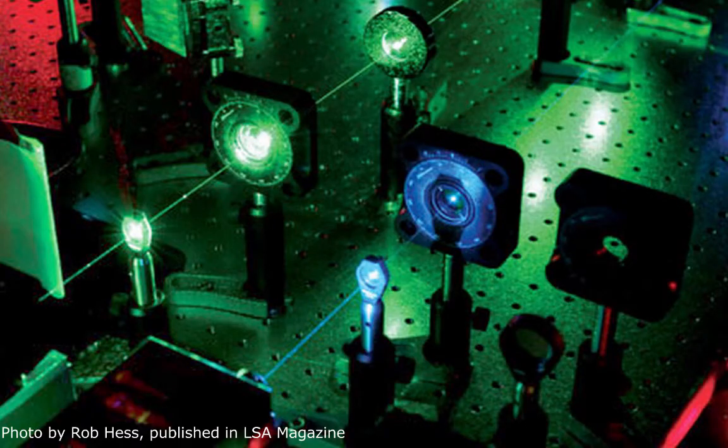We've been working very hard to try and figure all these things out, to determine a complete physical theory of this system. We are doing a lot of experiments. These are actually lasers that I use every day in lab, and also working from a theoretical perspective as well. And I'm confident that we will eventually get there, that we will develop a full theory, and with that insight, be able to design the best possible optical antennas to enhance single-molecule fluorescence microscopy, a technique which already improved the resolution of optical microscopy by an order of magnitude. And with the aid of these tiny antennas for light, we may be able to improve the resolution even further and open a window for all scientists to peer into the nanoscale world.